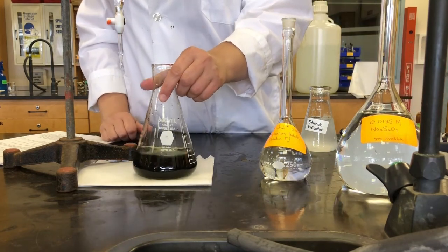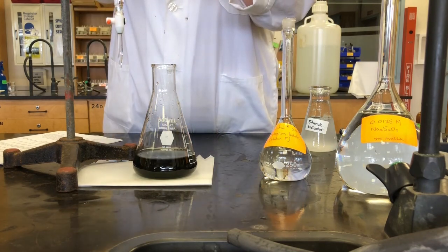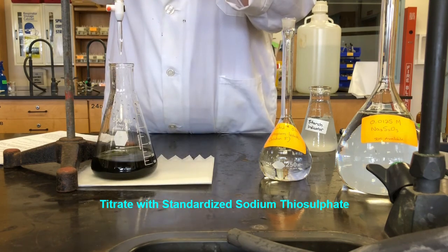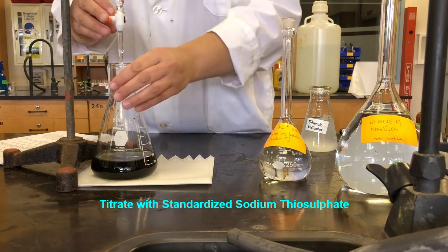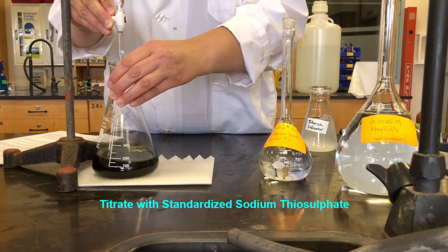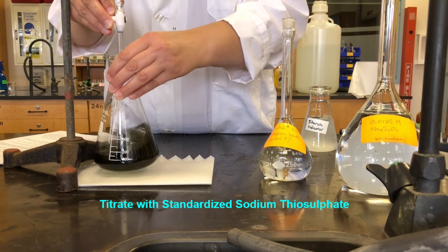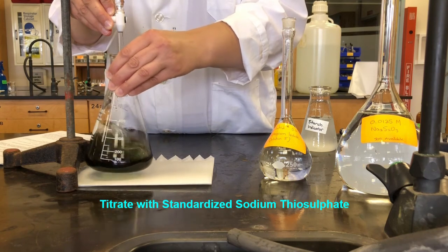And now we're going to titrate that with the sodium thiosulfate that's in our burette. Okay. So let's start our titration. And again, like any titration, we'll start slowly because we don't know how much it's going to take.